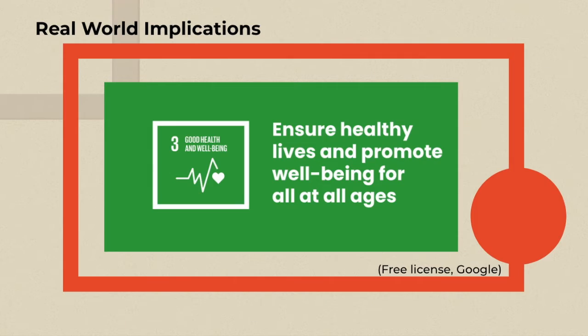This investigation has real-world implications. Using conclusions obtained from this investigation and its analysis has the possibility of reducing bacterial growth and transmission. For example, statistical tests showed that the use of 70% alcohol hand sanitizer was significantly more effective than the 62% hand sanitizer at inhibiting and killing bacteria. Thus, this investigation could be implemented worldwide in order to improve hygiene and sanitation, as well as reduce the transmission of diseases and bacteria in public areas and urban cities.